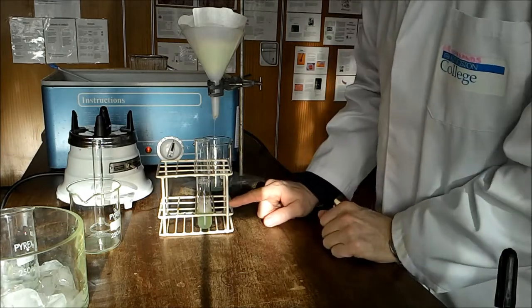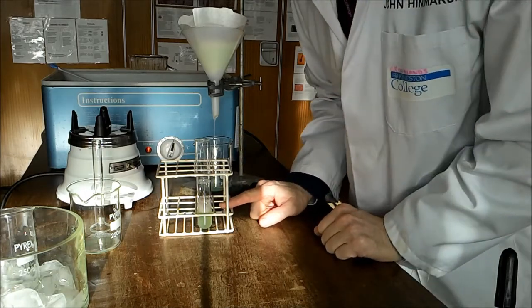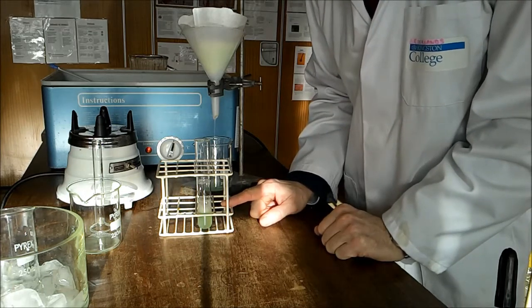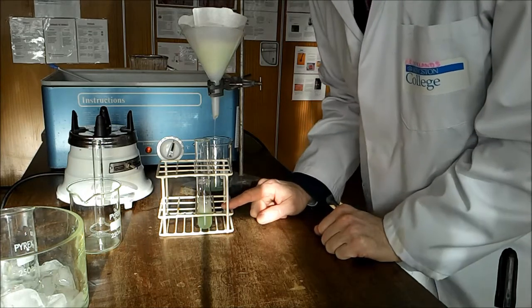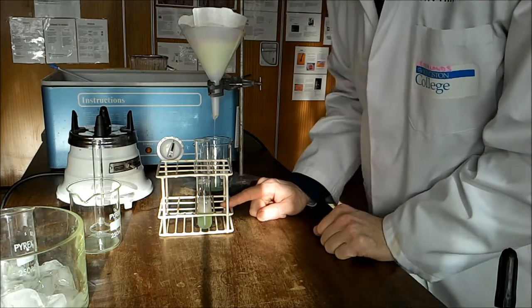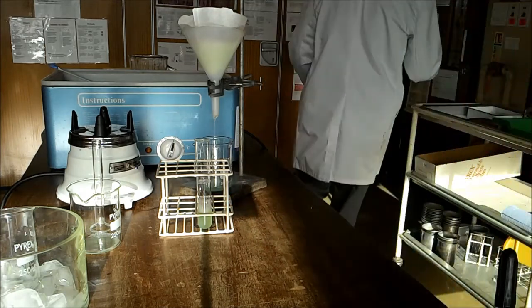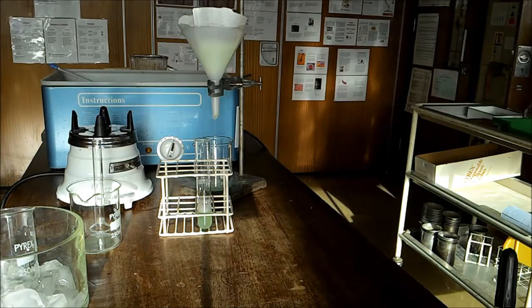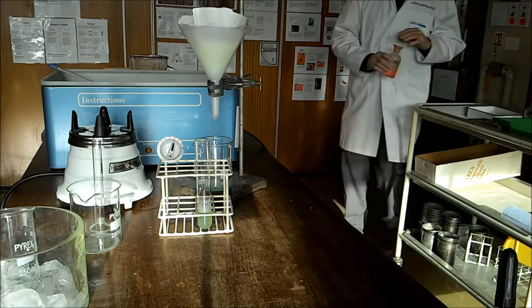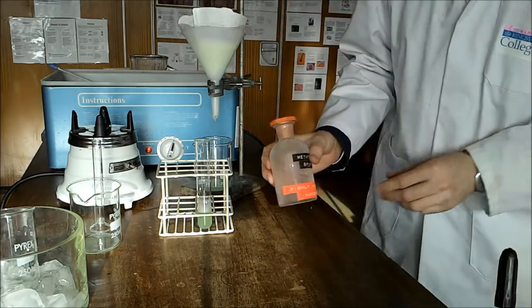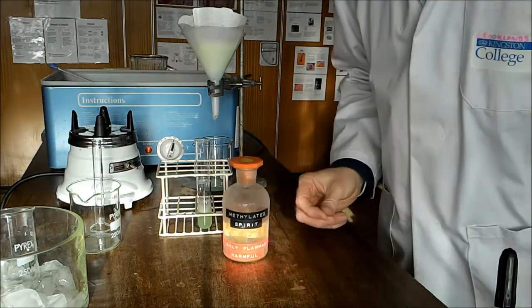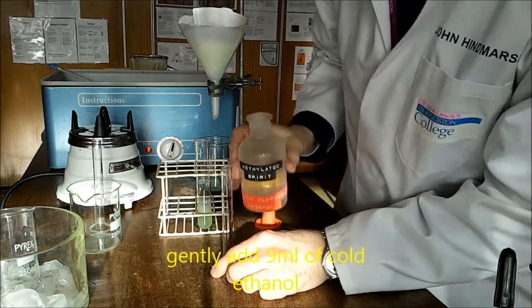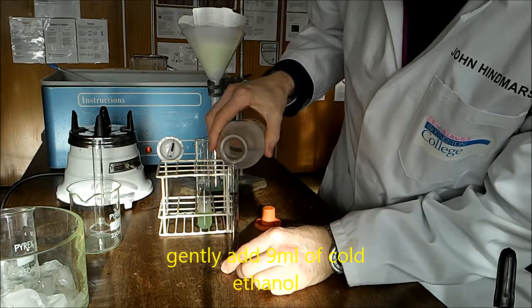In order to precipitate out the DNA, we need to add ice cold ethanol. We are going to add 9 cubic centimeters of ethanol.